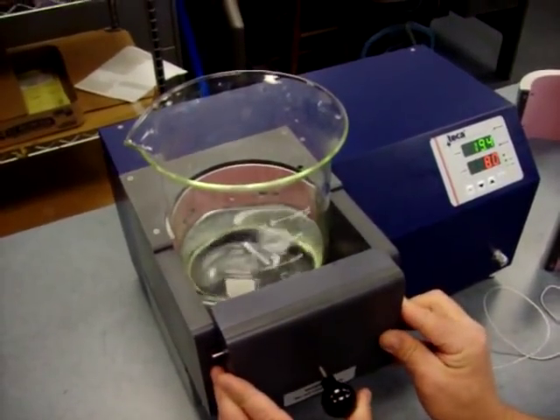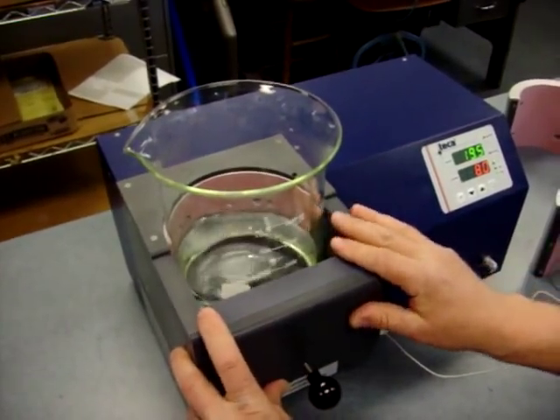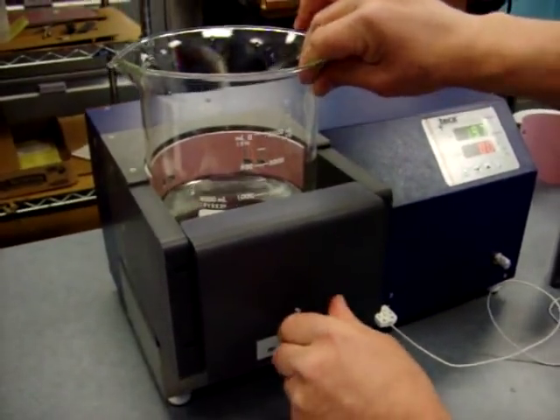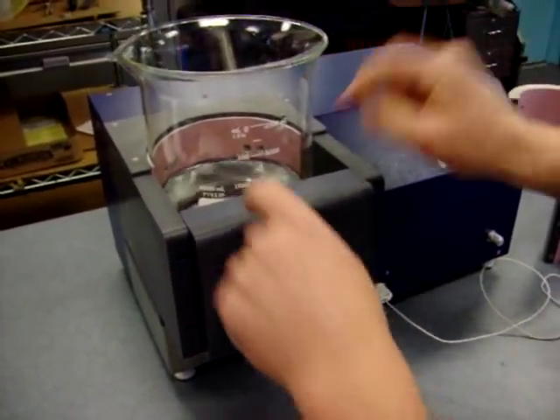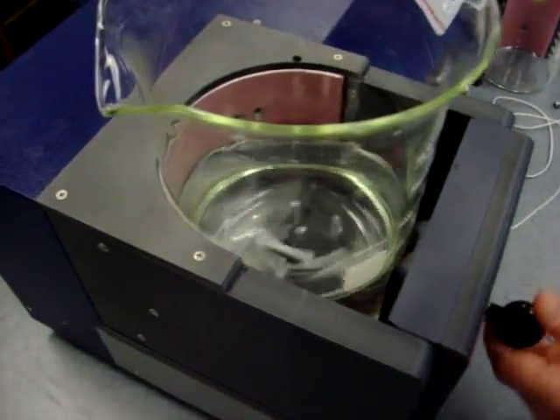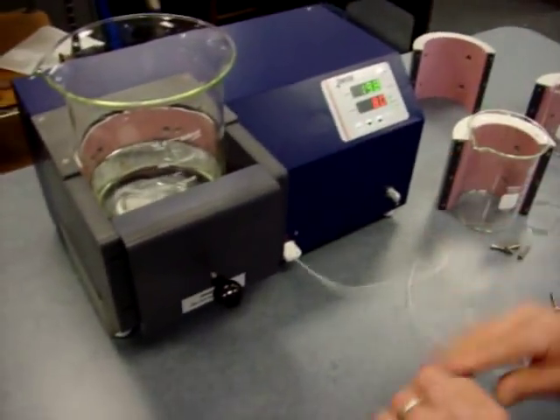We can make pretty much all sizes up to that. We've made a little bit larger and we've made irregular shapes. That slides forward and down, and then I clamp this just snug. That's pushing a gasketed bar against the beaker to hold it against the gap pad for your heat transfer.